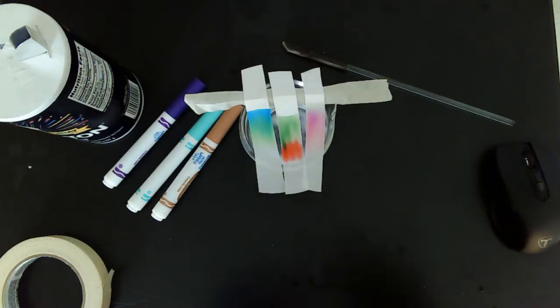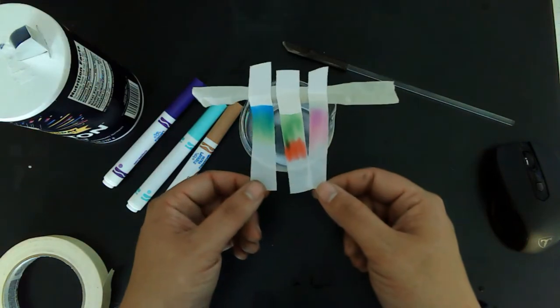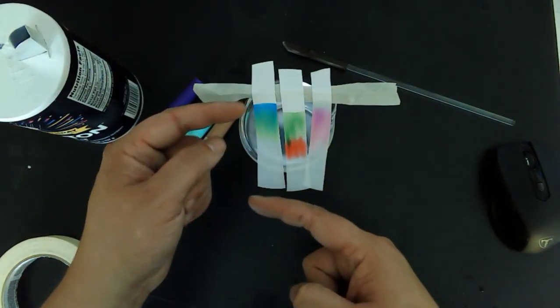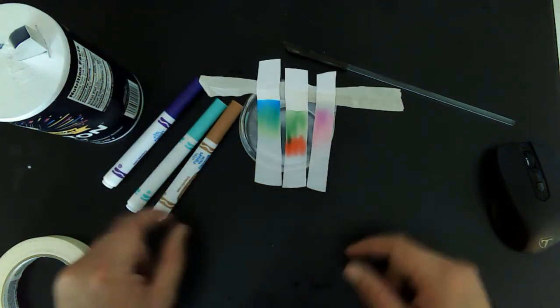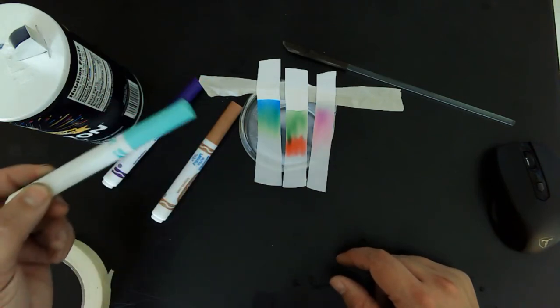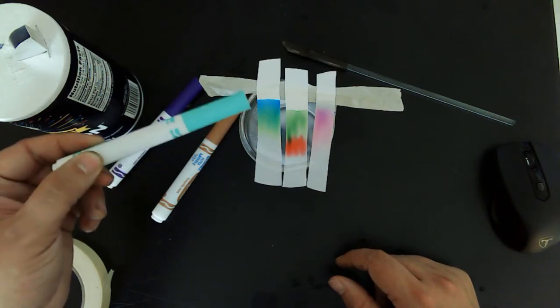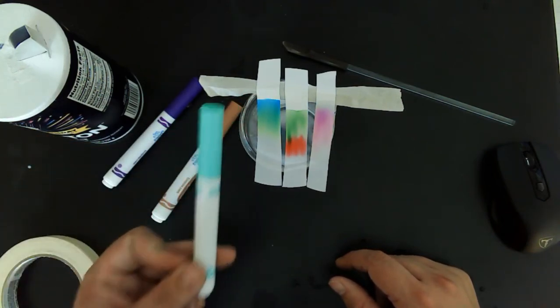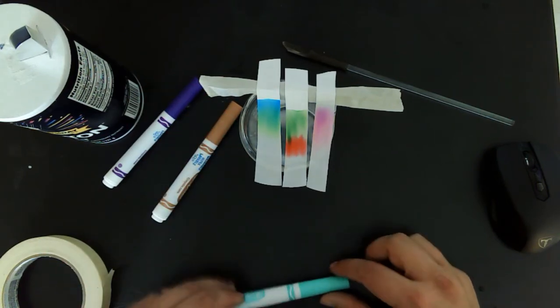Alrighty, it has been about 15 minutes, and so what we see is that the solution has traveled up about as far as it's going to go. It could go a little further, but after 15 minutes we call it done. So what do we see? The seafoam green color is a mixture of yellow, green, and blue. There's a lot of blue pigment, some green, and a very little bit of yellow. So this is a homogeneous mixture of those three colors.